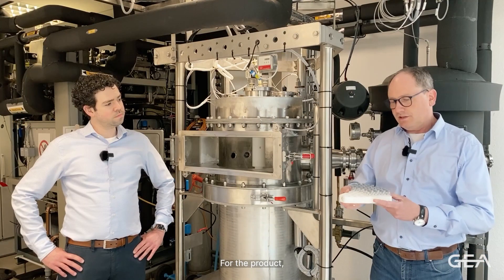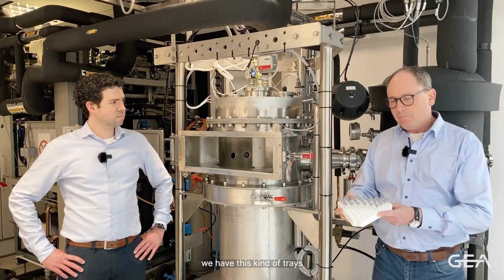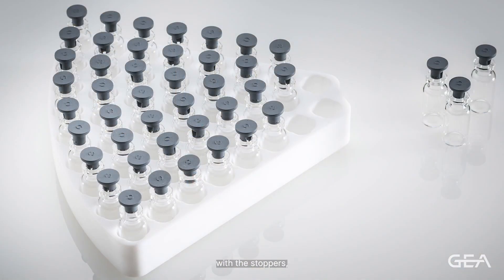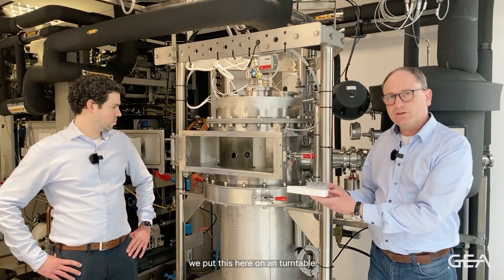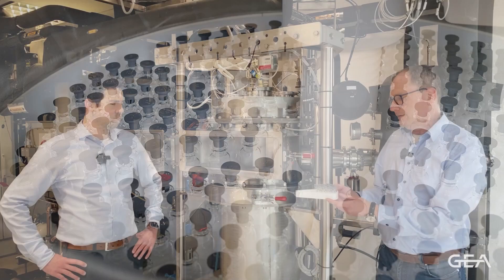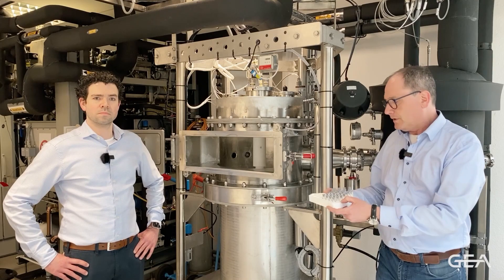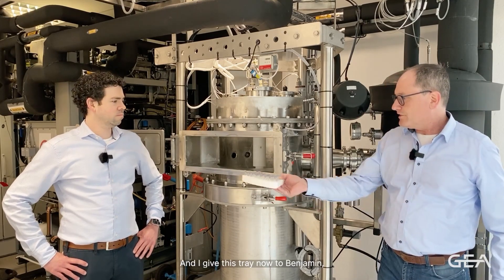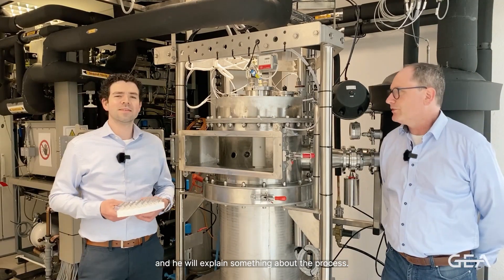For the product, we have this kind of trays, and in the trays you can place your vials with stoppers, as you know from the normal freeze drying system. These trays we have here in the turntable, and the trays will turn during the drying, like in your microwave system at home. I'll give this tray now to Benjamin and he will explain something about the process.